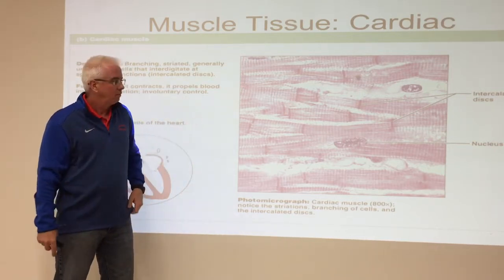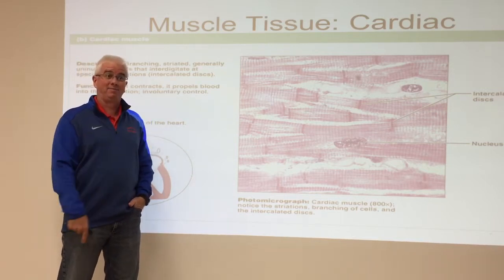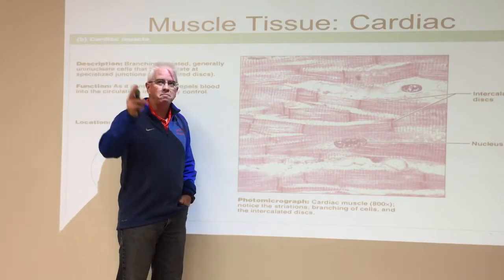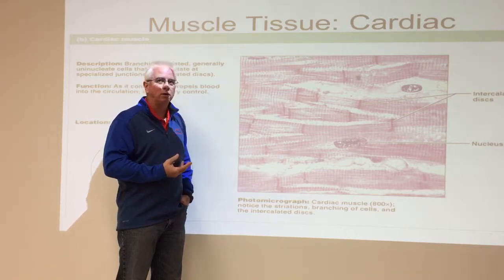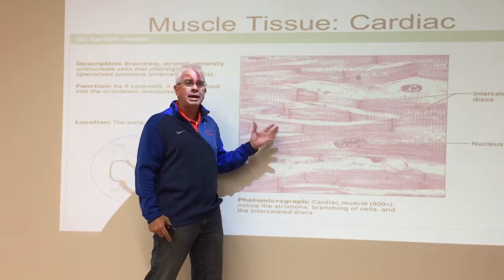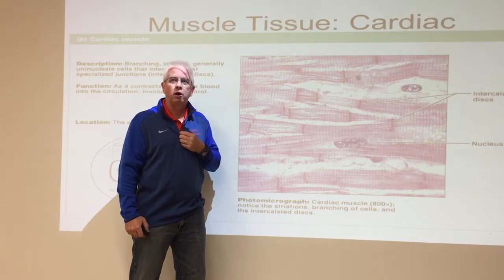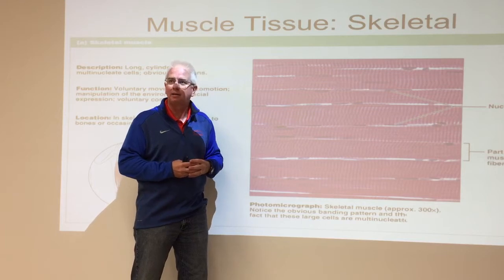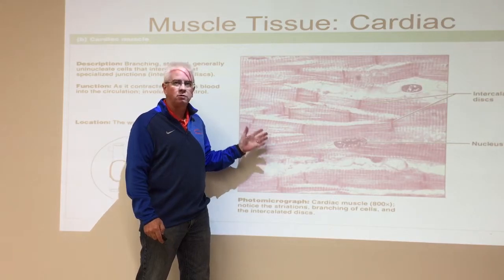Yeah? What else? A lot more white. A lot more white in the picture, okay? Now, if we're going to use that messy and a lot more white in our description, we might say it more sciencey, right? We might say there appear to be gaps between the cells in the cardiac muscle, whereas the skeletal muscle cells appear to be stacked. And that is a very important observation between the two.